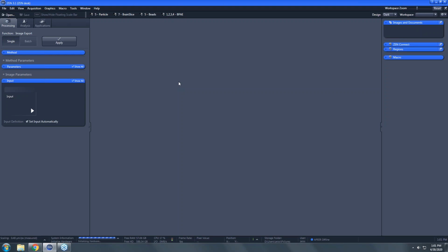If any of you have Zen Lite or have downloaded the 90-day trial, feel free to have that open as well. You may find some things that you didn't know existed. So feel free to have that open, might be helpful.